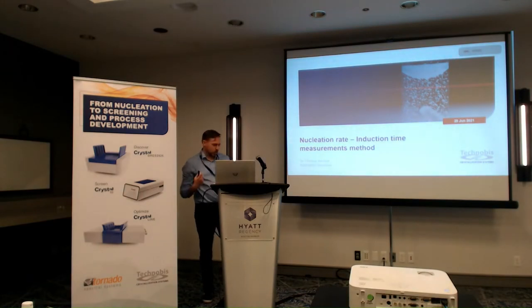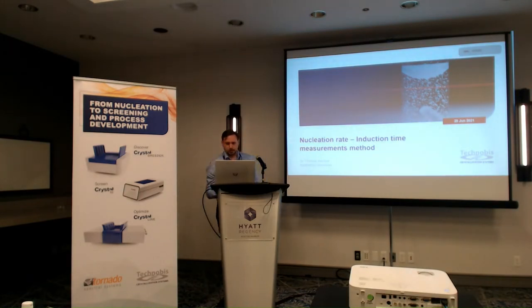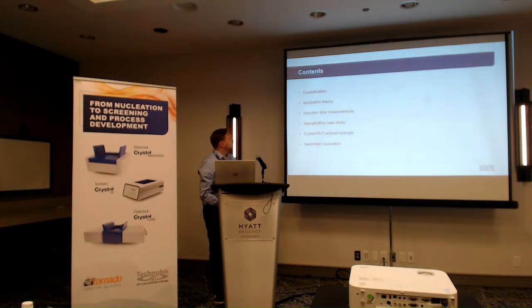Okay, so as Fernando said, I'm giving the talk based on measurements of nucleation rates using induction time measurements. This is, again, something that's quite new for Technobis. It was developed using our instruments in the past, but it's now something we've been able to incorporate into the newer instrument.